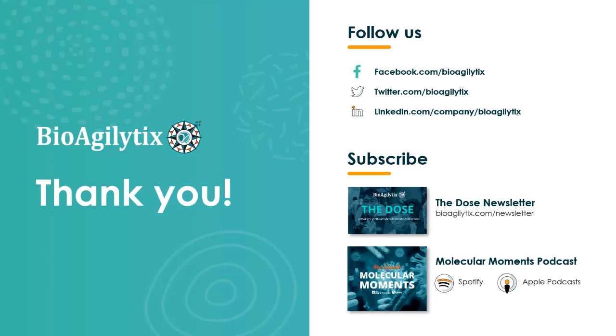Thank you. And the last question I have here is, what happens if you have positive RCL samples from your drug product? I really hope you don't get any positive RCL results for your samples. But if you do, first, that fails your product release specification, so it will be an out of specification investigation.